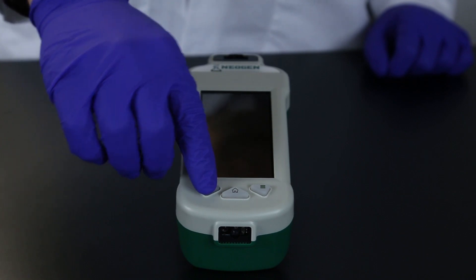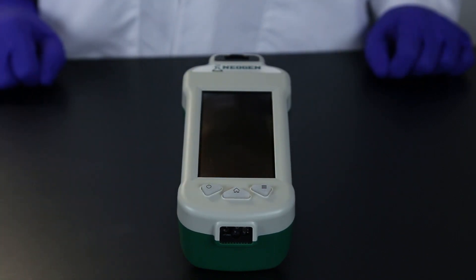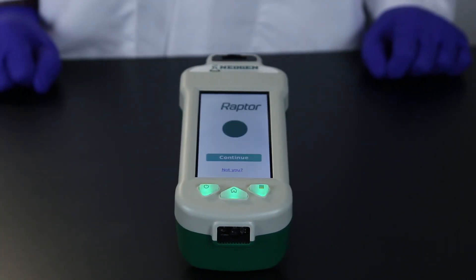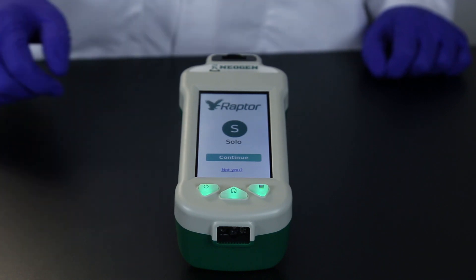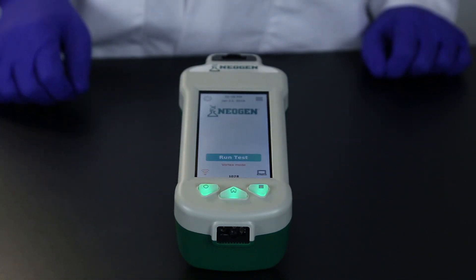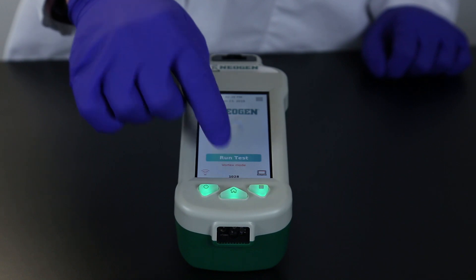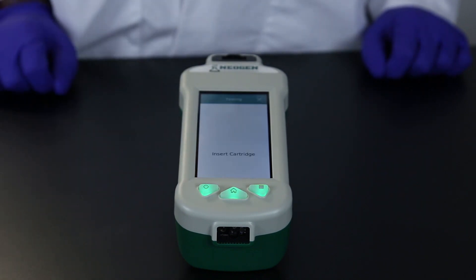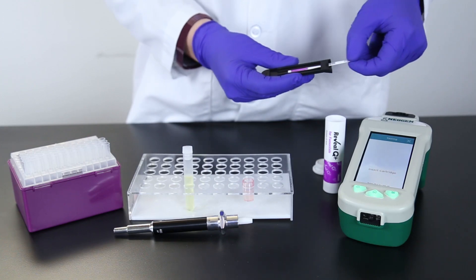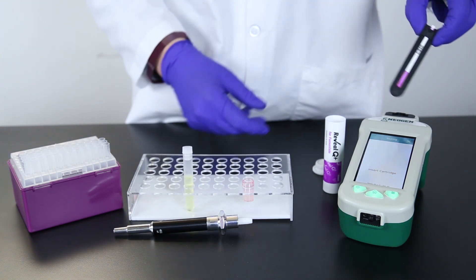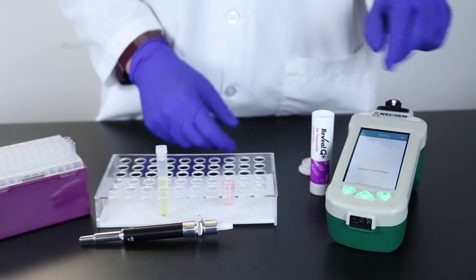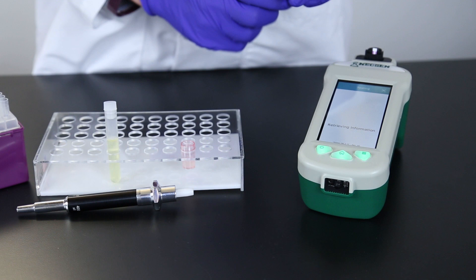Turn on the Raptor Solo by pressing the power button on the bottom left hand corner. The system will initialize and display the home screen. Press the run test button. Place a test strip into the Raptor cartridge. Place the cartridge in the Raptor Solo system. The Raptor Solo system reads the barcode on the strip.